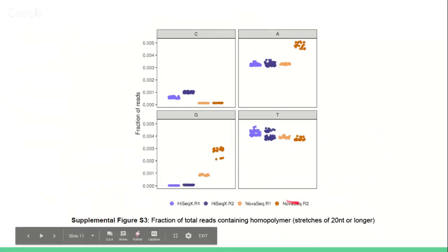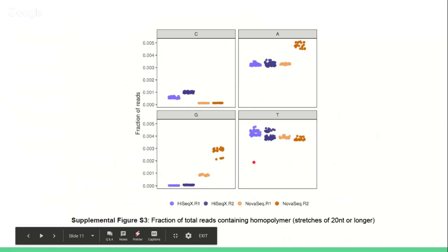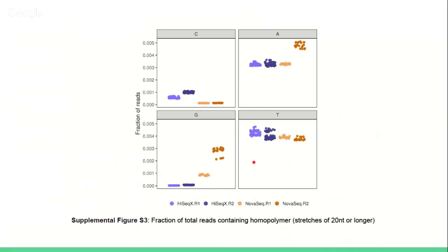And this read 2 on the NovaSeq, read 2 is usually noisier, but not always, than read 1, has also more homopolymers in the poly A. Part of this could be simply due to the length of the insert sizes, and this is especially important for applications such as FFPE, where the molecules that you're trying to sequence have been degraded by being fixed in formalin. And these poly X plots are also always an important metric to consider when you get your results out of the sequencer, or in this case, the Illumina sequencer. I presume it will be the same for the BGI-MGI technology.